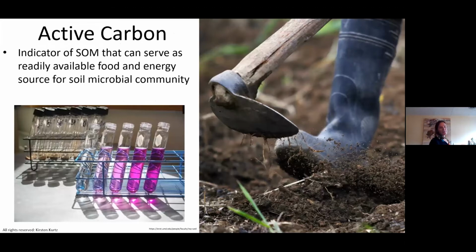We also measure active carbon in our lab. This is a very well-established soil health test. This was developed by Ray Weil, and it's a very strong test as far as getting at the overall soil health. The way that I like to think about what active carbon really is, it's along the same lines as what I was talking about with protein. In this case, we're talking about the part of the soil organic matter that can be easily metabolized and used by the microbes and also re-released as nutrients. And that's that active carbon.